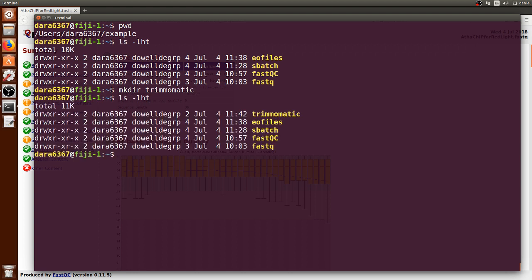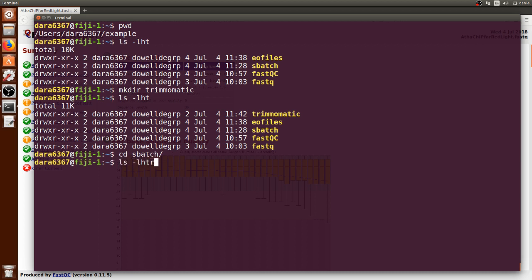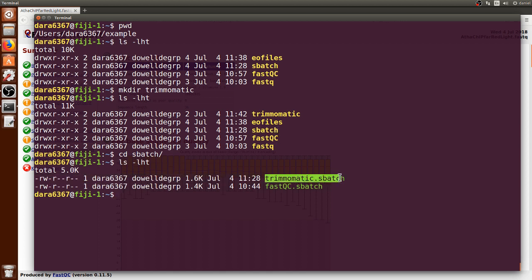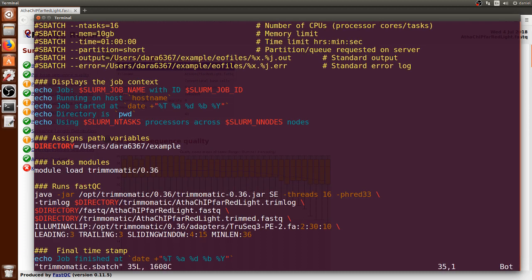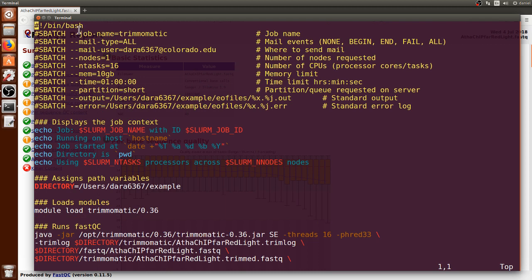We can list it and see that it's now there. We can now go to the sbatch directory to explore a file that I just created that runs Trimmomatic. It is called trimmomatic.sbatch. We can open it through Vim and go to the top of the file.